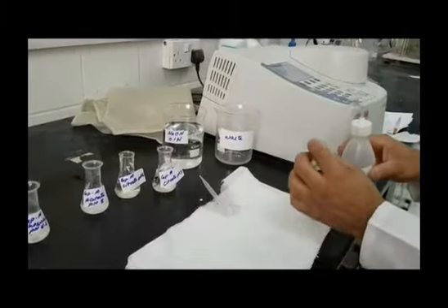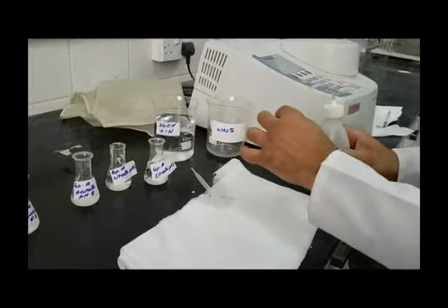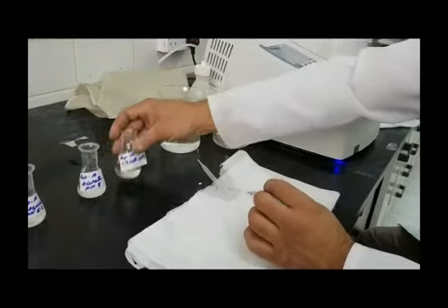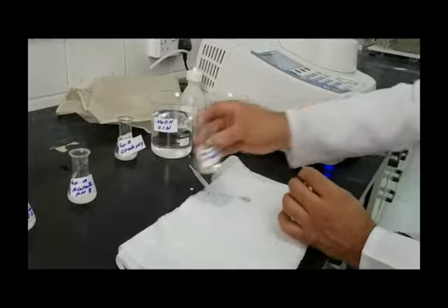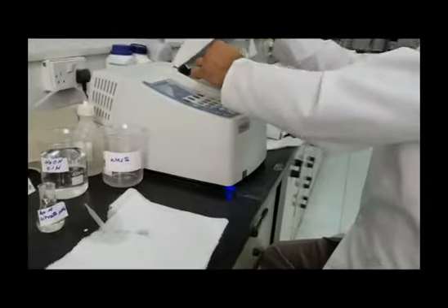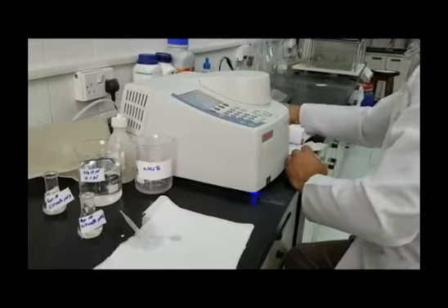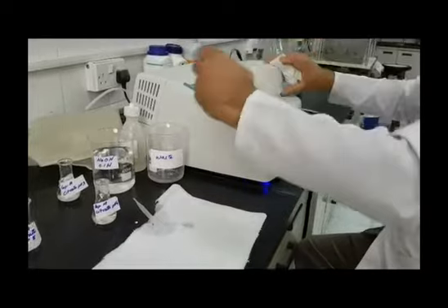Always start with solutions where you expect to have the lower concentration of the substance of interest. Here we expect the lowest solubility at the lowest pH. Then we will start measuring from the citrate buffer pH 3 solution.